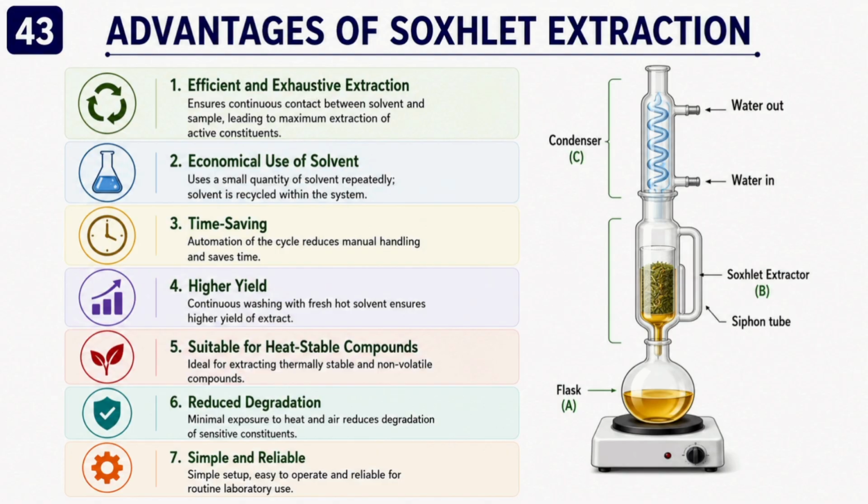Okay, however, remember one important point: heat is involved. Therefore Soxhlet is not suitable for all drugs, especially heat sensitive constituents.